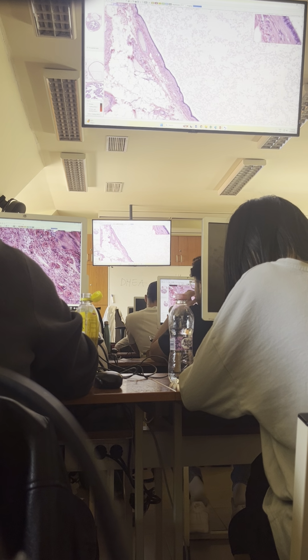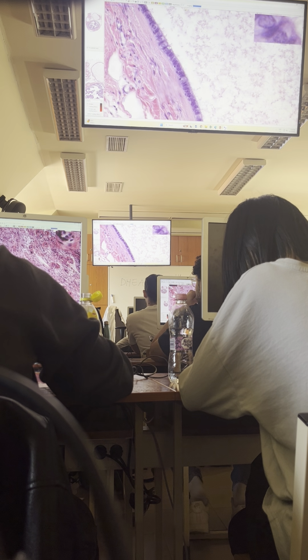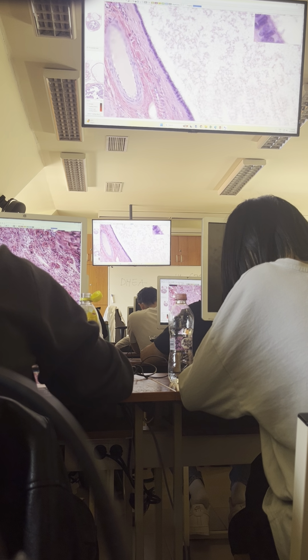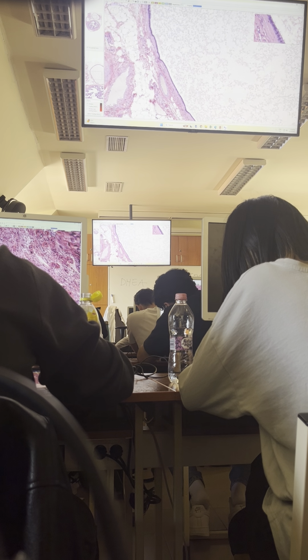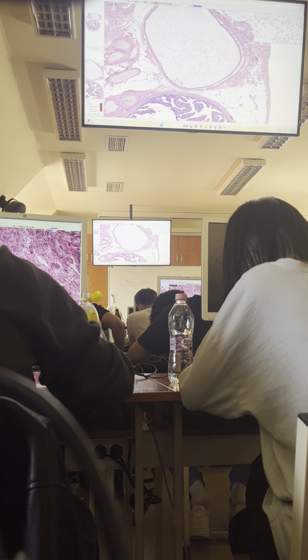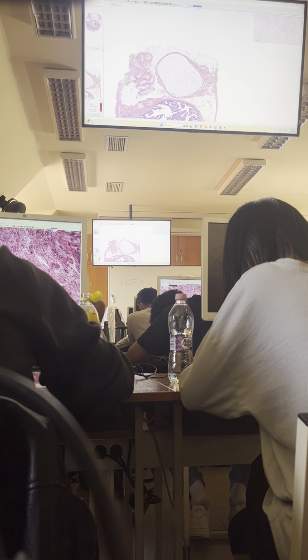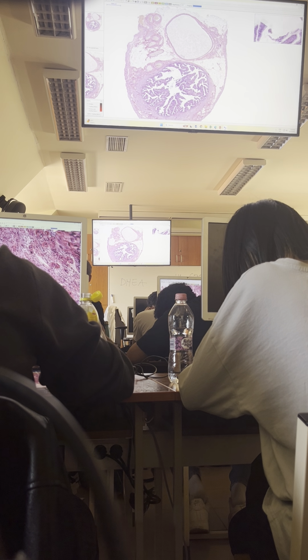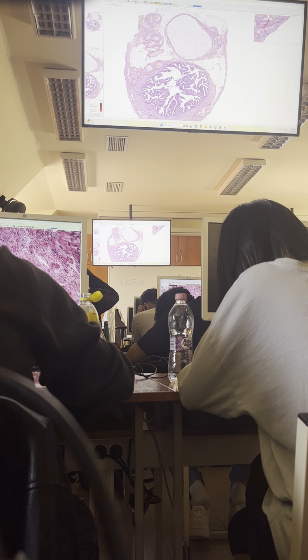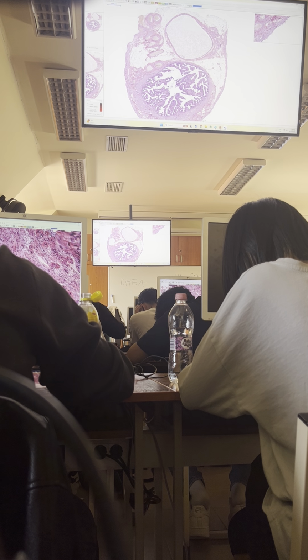If you look at the lining epithelium, it is something like simple columnar here. So it is much more regular. Let's compare to the progesterone phase.